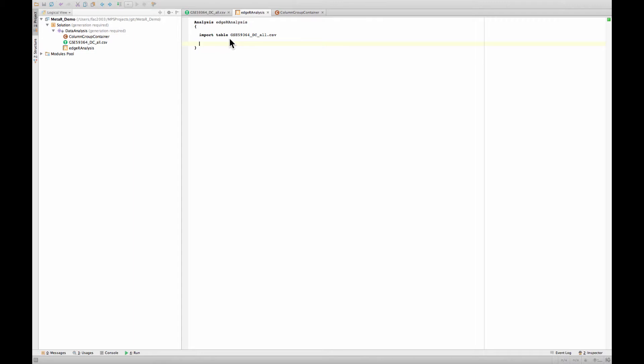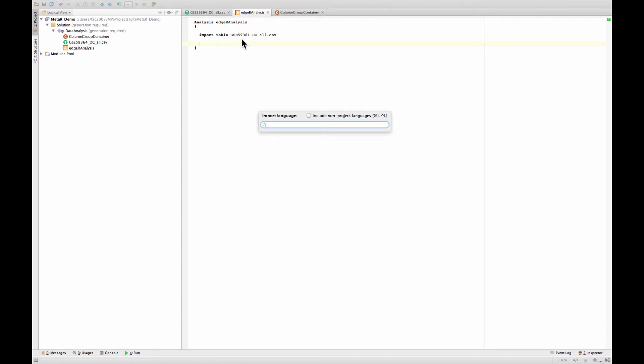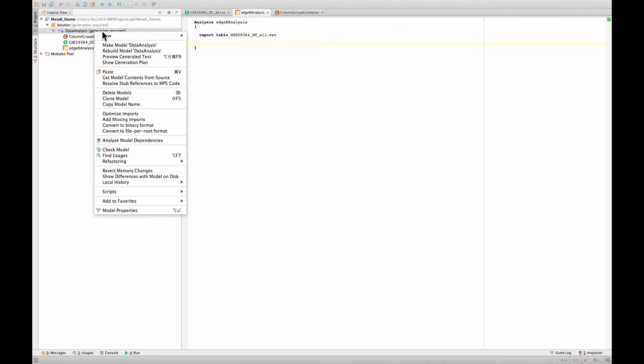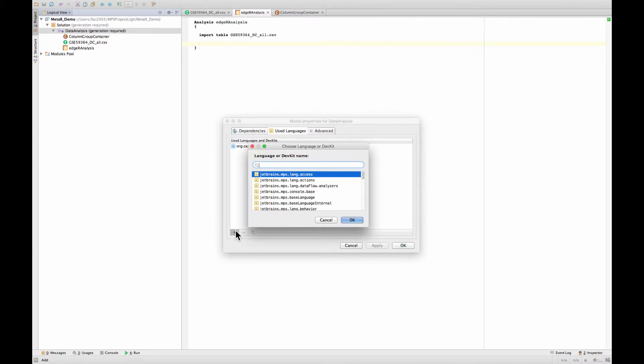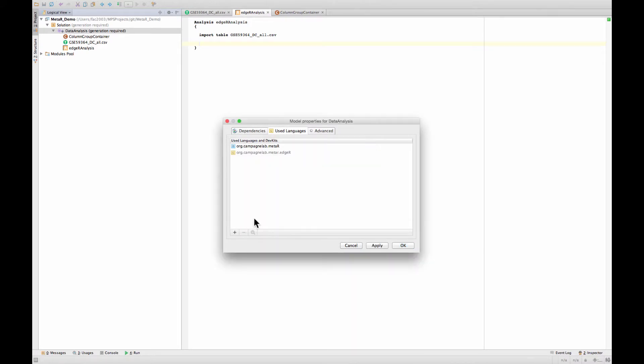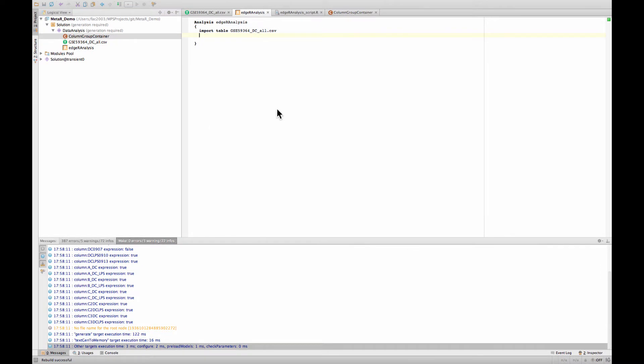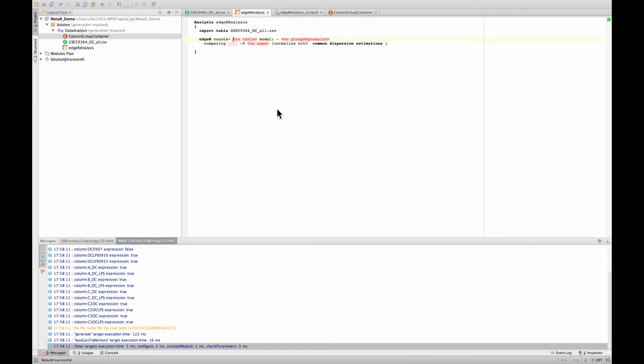Instead we will use this to do an edgeR differential expression analysis. At the moment by default MetaR does not include the edgeR language, but this is relatively easy to remedy. You can import the language. You do this by pressing Apple L import language, or you do this by right clicking on the model and choosing model properties and adding here under use languages. We are going to go and look for the edgeR language. Now that we have imported the edgeR language, we should be able to find it among the statements available.